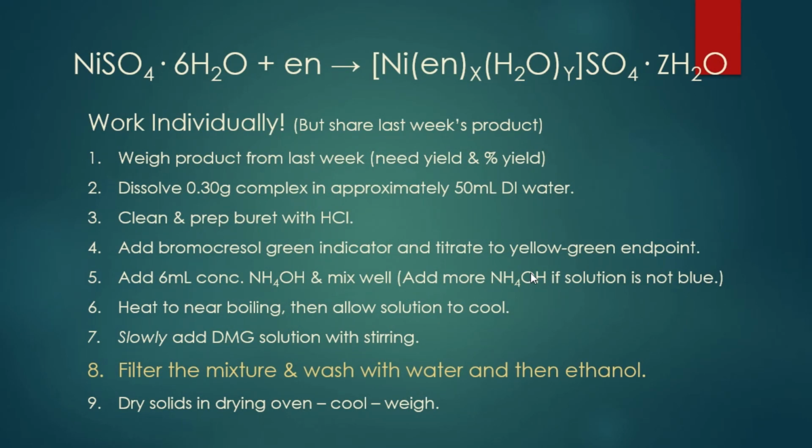I can't imagine ethanol is going to take that long in a 100-degree oven. You might want to check it after 10 minutes. You'll see it looks like a potato chip coming, separating from the paper. Yeah, it's going to be pink. It should look dry and brittle, and it may well be peeling off that paper as well. Give it 10 minutes, but after 10 minutes, I would think all the ethanol is going to be off, especially since it's as hot as we have the oven.